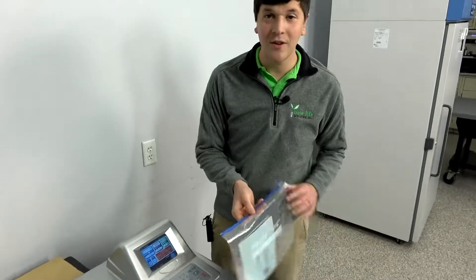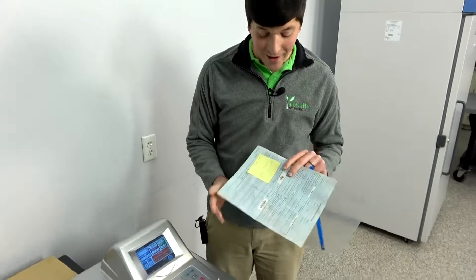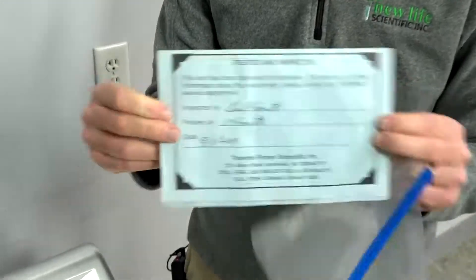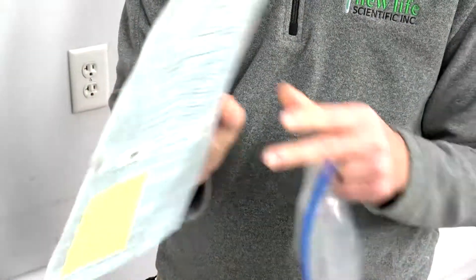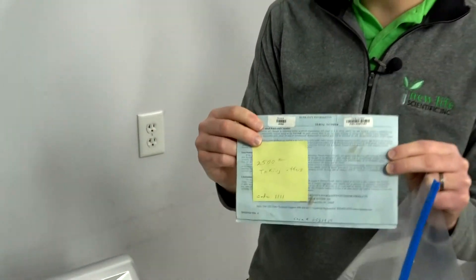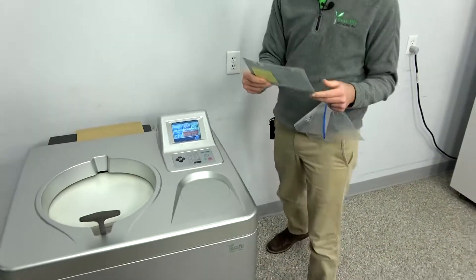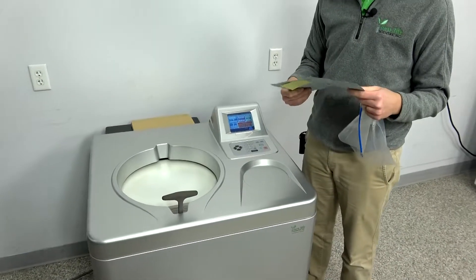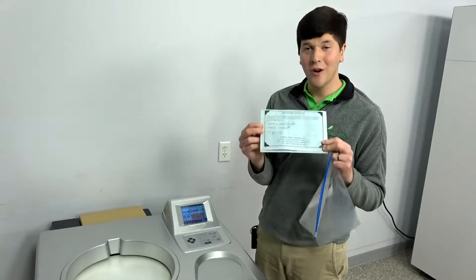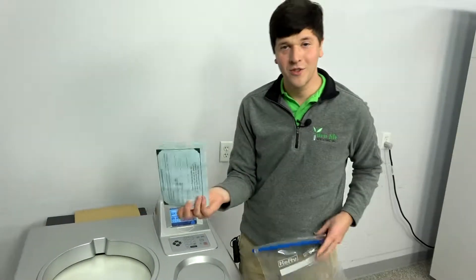And if you like to keep weird pieces of paper in your files, we do have the tested and inspected document from May 1st, 2009, with stickers giving you the model number and serial number. The serial number will be handy because this instrument appears to be missing its data plate, so you'll want to keep this document. Interestingly, it says packed and inspected May 1st, but Sorval told me about 20 minutes ago that the manufacturing date is May 4th — so choose who you'll believe.